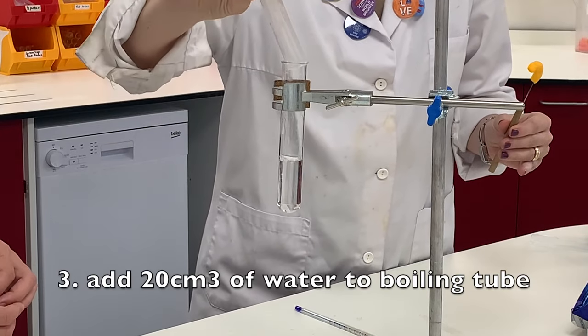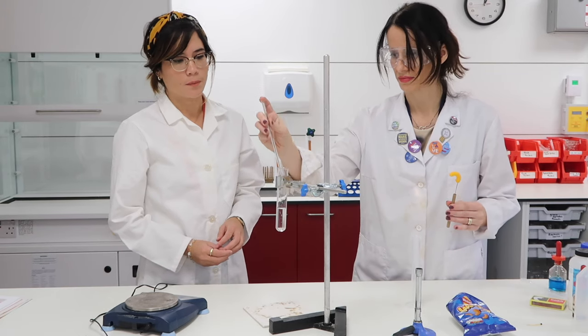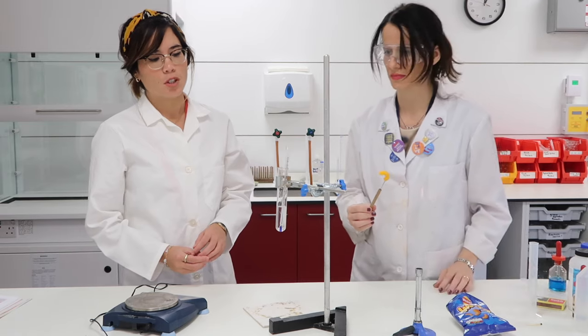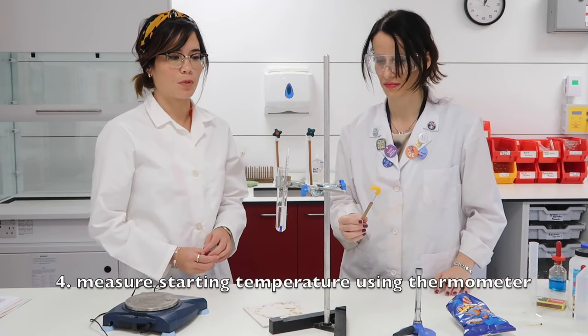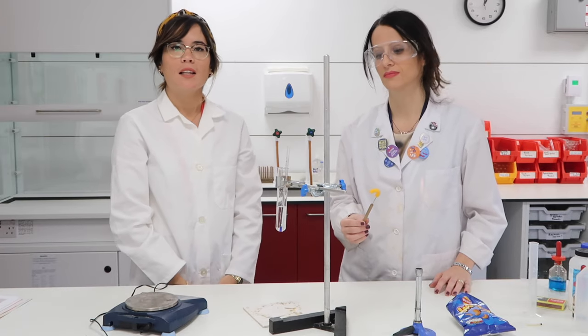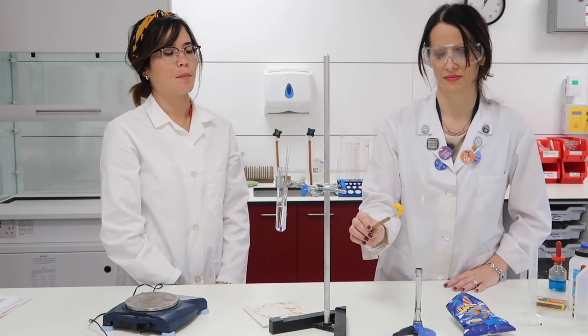Amelia is then going to pop it on a mounted needle. The next step is to add 20 centimetres cubed of water to a boiling tube, and we're using a measuring cylinder in order to do that. Amelia has popped a thermometer into the boiling tube so we can measure the initial temperature — we're just going to wait for it to calibrate.